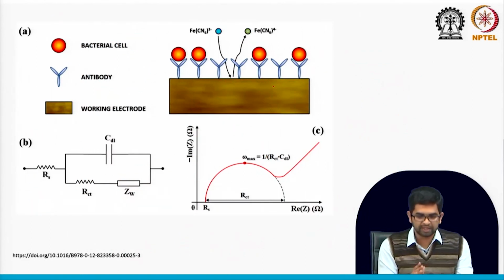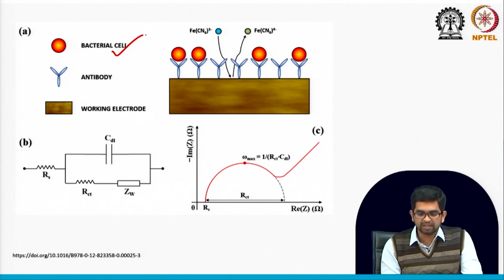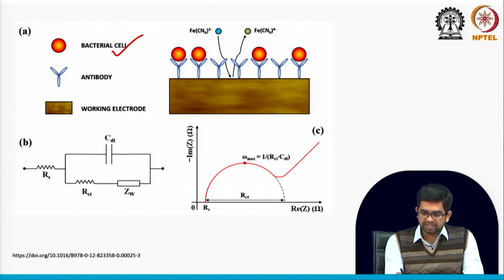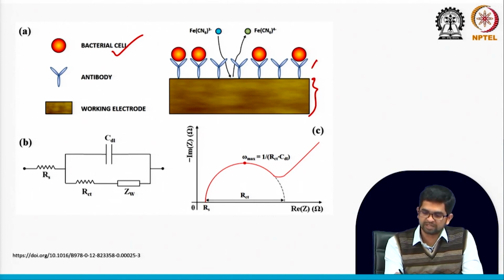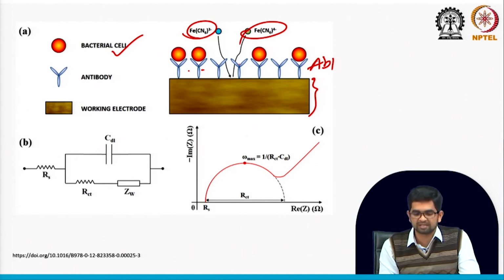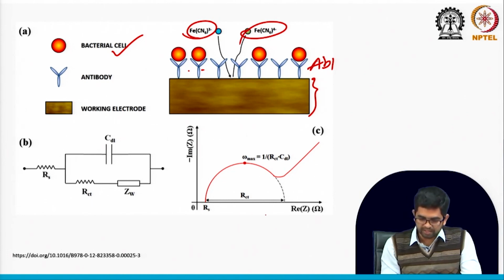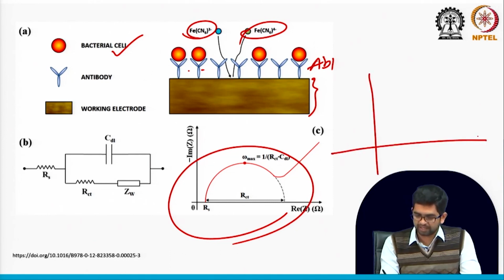So we will develop a biosensor for, suppose, bacteria cell detection. How will the impedance spectra look, how can we predict? Okay, so you can see here this is your transducer surface, and first we will immobilize the antibody layer, the primary antibody, that is very specific towards your target, the bacteria cell. Before the bacteria cell, there is lots of gap, and electron transfer will be pretty fast. So you will see this kind of a very good electrochemical impedance diagram at the very beginning.